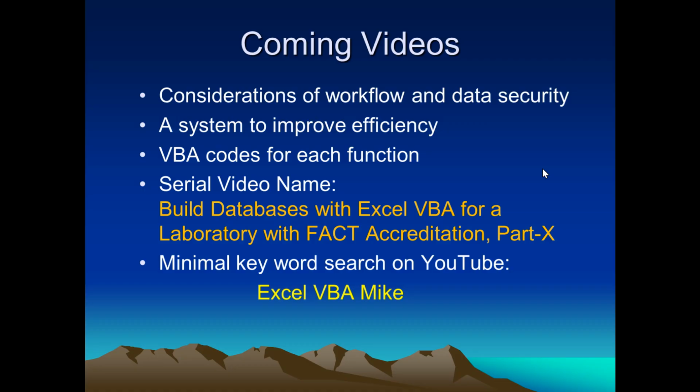This is the system I built, and the goal is to improve efficiency. I will also show all the VBA code for each function. The name for this series will be something like Build a Database with Excel VBA, part 1, 2, 3, and will be continued.